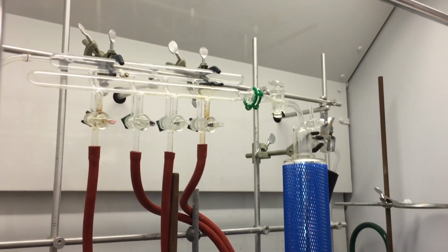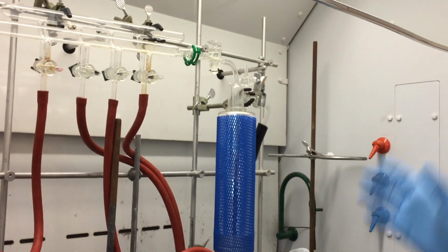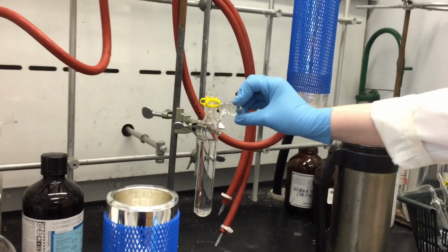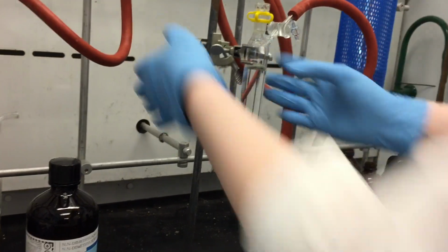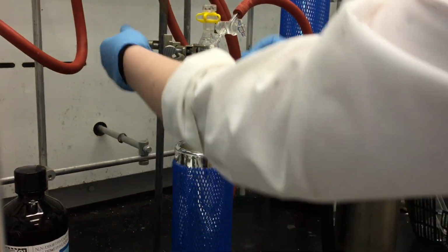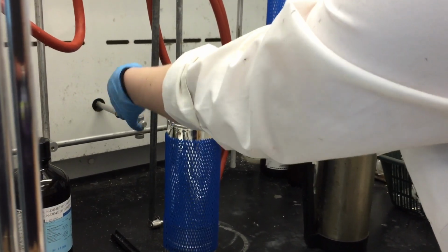And so the next thing you're going to do is follow the method. So it's freeze, pump, thaw. The first thing you want to do is make sure that your tap to the solvent is closed. I'm not going to do this part under a vacuum. And then you are going to use a smaller dewar for this part. You're going to drop your solvent down into the dewar, and you're going to fill it with liquid nitrogen.